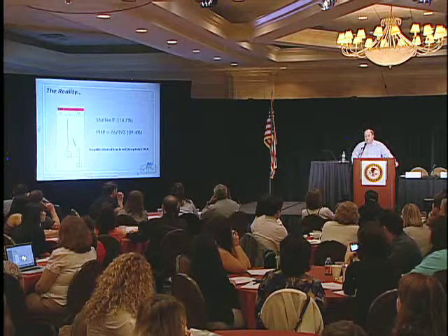It's under 15%. But it's also a peak height ratio of 39.4%. So I don't know. Maybe it is stutter. Maybe it's not. The issue here is we're at this low template level. It's difficult to distinguish whether this peak at 25 is an authentic stutter peak or if it's an allele.